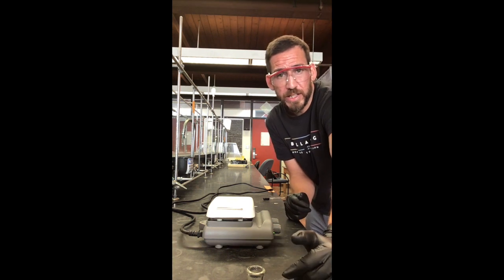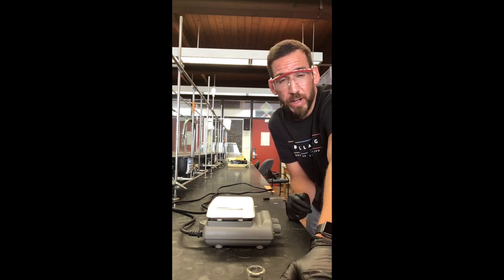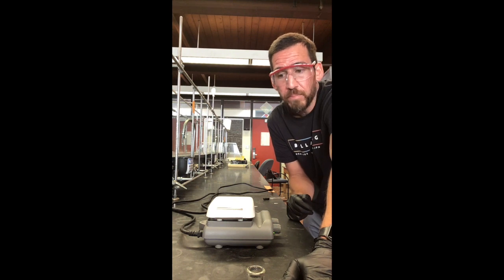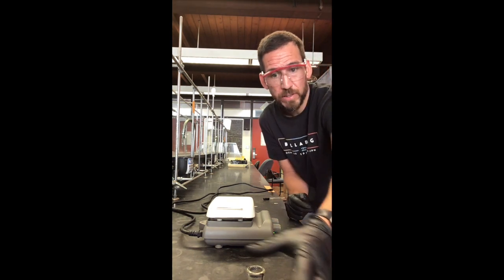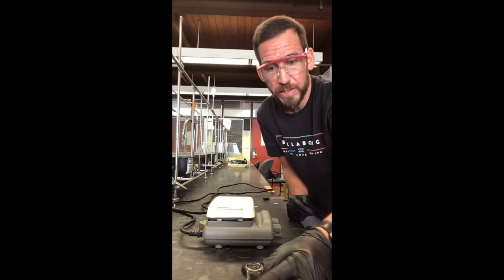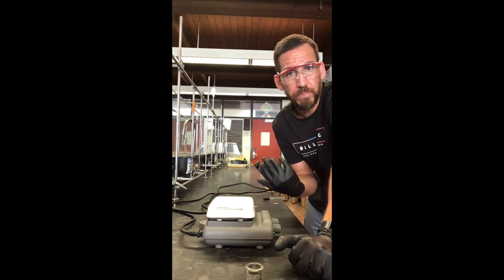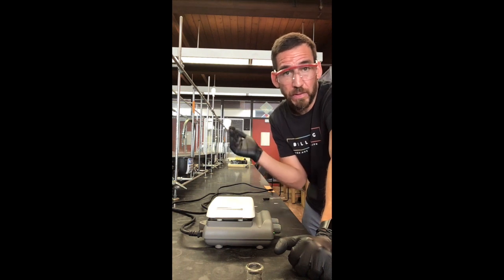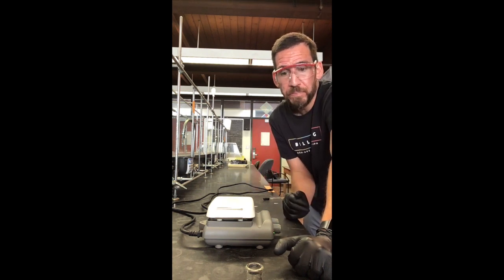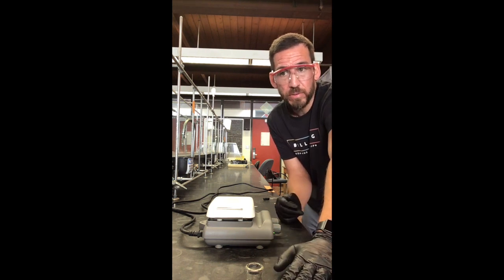Now, for crystallization, there's actually a lot of different ways to do this. One of the more common ways that we do it in our lab is by just dissolving it in the minimal amount of hot solvent. Okay, so what is this thing soluble in? That's going to allow for crystallization to occur. Oftentimes, since these are known procedures, there are already a lot of methodologies out there, or procedures outlining it for us. And so for caffeine in particular, I'm going to use ethanol.